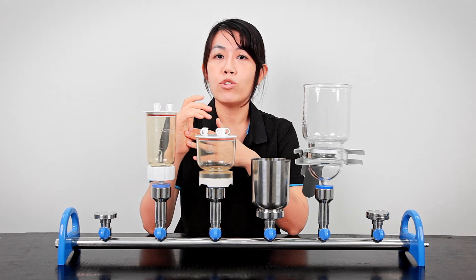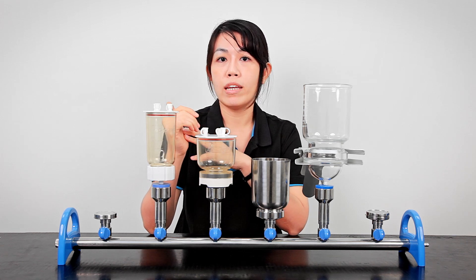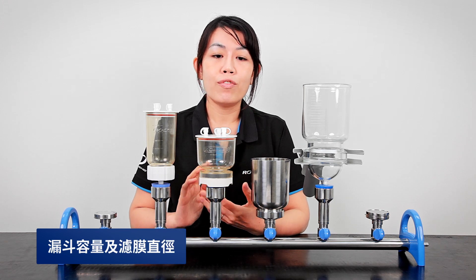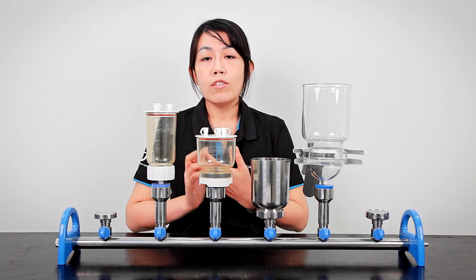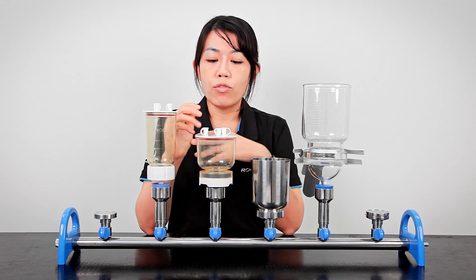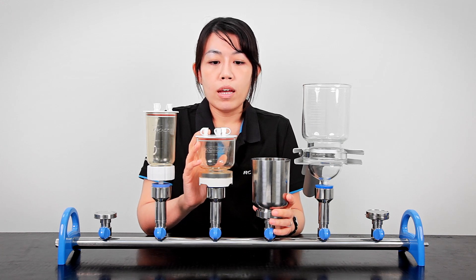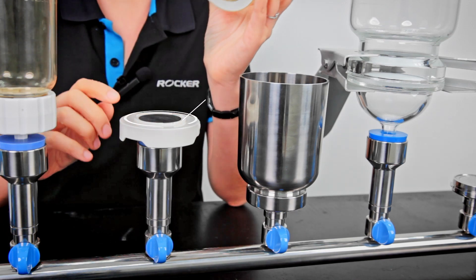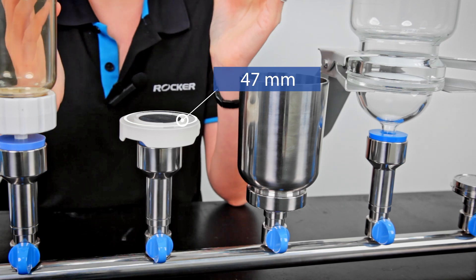I'm going to share some points to consider when deciding if a funnel is suitable for your laboratory and your work. The first thing to consider is the capacity of the filter funnels, which is usually dependent on the volume of your samples. If you filter less than 1000 ml per time, then a 300 or 500 ml filter funnel may be enough, and these funnels usually come with a holder that accommodates a 47 millimeter diameter filter — the most common membrane filter in the market.